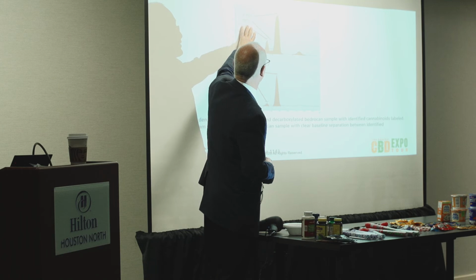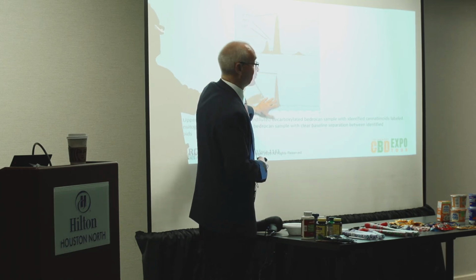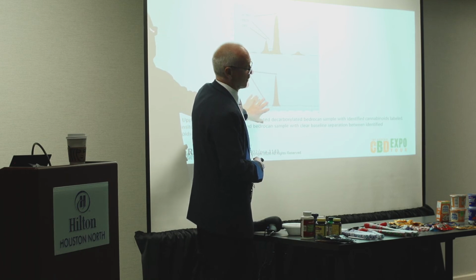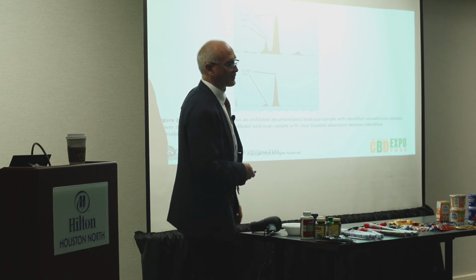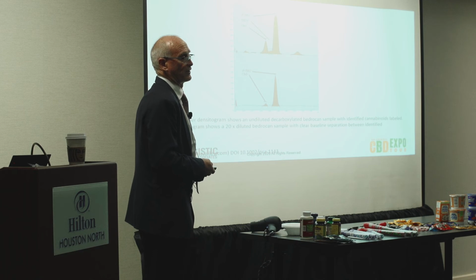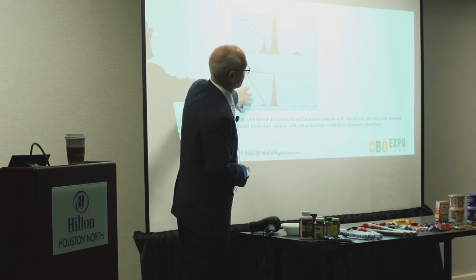Now if you dilute this, you don't see the other components because they're too diluted to show up on a thin layer chromatography. Typically, anything under 2% of a compound will not show up on a thin layer chromatography. So that's one downgrade. You're not going to be able to tell if you have the 0.3 because it only goes to 2%. That's because of the concentration.